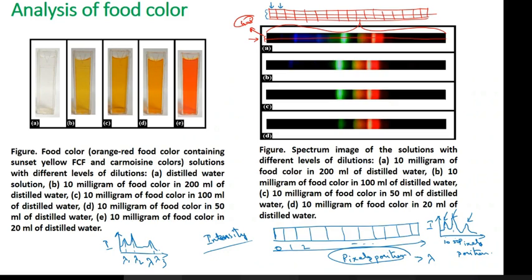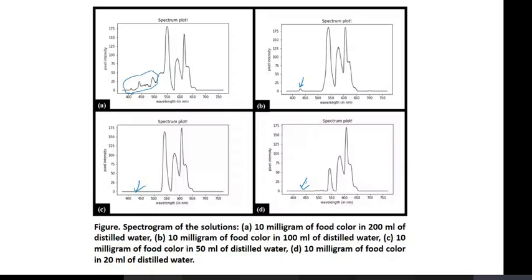If you do not have a spectrophotometer, if you are working on the visible spectrophotometer, you can design your own spectrophotometer in your lab. Okay, it will not take you much money. If you have a basic knowledge of electronics, you can design your own spectrophotometer. And as a teacher of medical electronics and instrumentation, I would guide you in the following lectures. Whatever techniques we study, I will try to give you some idea.